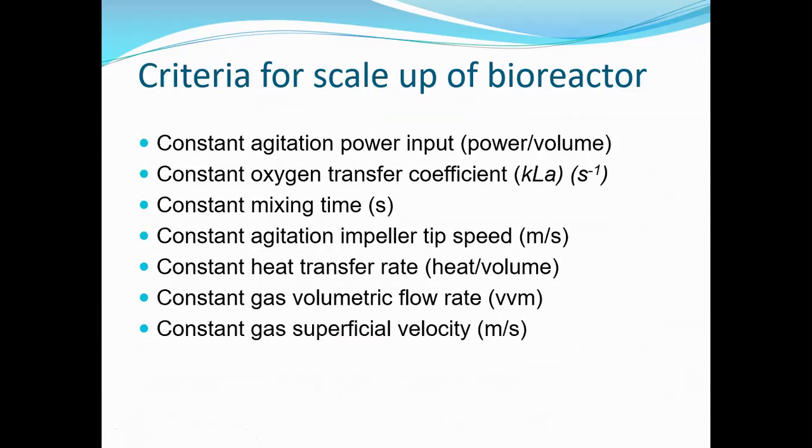Okay, so there are various criteria for the scale up of bioreactors. These all need to be kept constant: constant agitation power input, constant oxygen transfer coefficient, constant mixing time, constant impeller tip speed, constant heat transfer rate, constant gas volumetric flow rate, and constant gas superficial velocity.